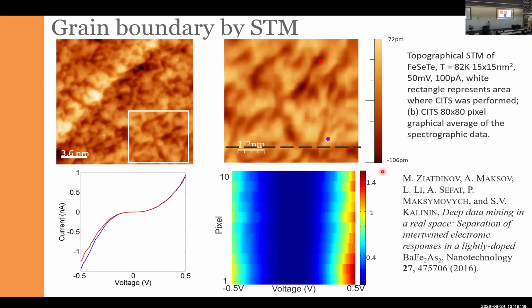So what type of information can the PCA give you? I'm going to show you examples which come from many fields and not only electron microscopy, primarily because in many other techniques, it's much easier to explain what you're looking at. Imagine that you're taking an STM data set. Here you have an XY plane, and then at each location you take an IV curve. How are you going to interpret this?